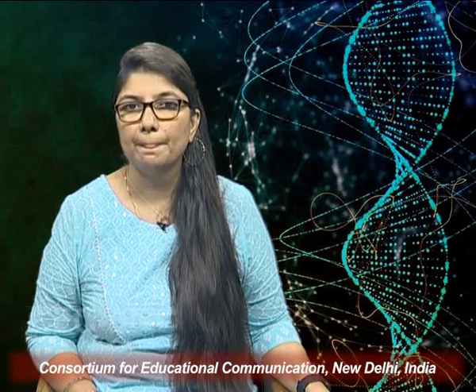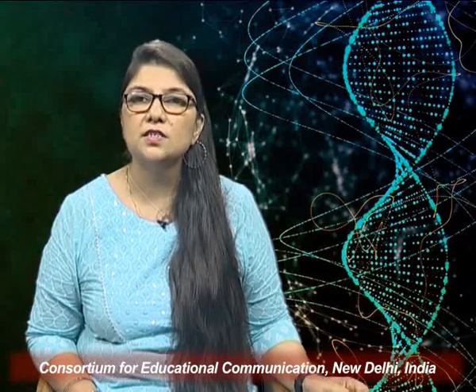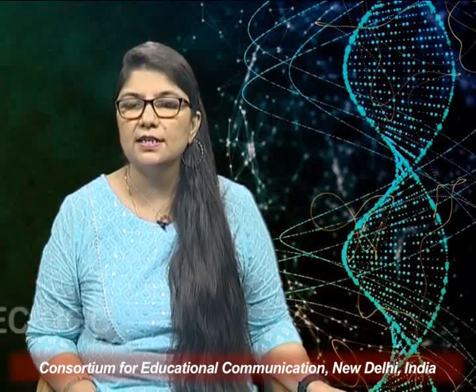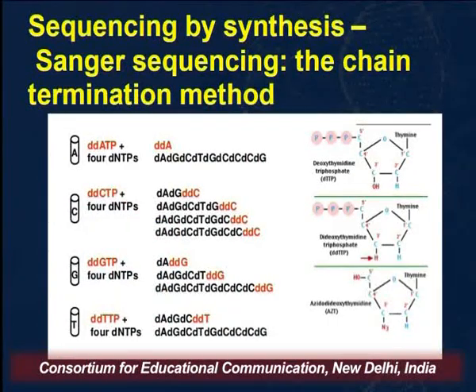One of the methods that I discuss today is the Sanger sequencing method. It is an old method, but it is still very widely used. The entire technique has been automated, but still, the basic principle we need to understand is basically sequencing by synthesis. As the complementary strand of the DNA template that you want to sequence is synthesized, it is basically read. So the order is read.